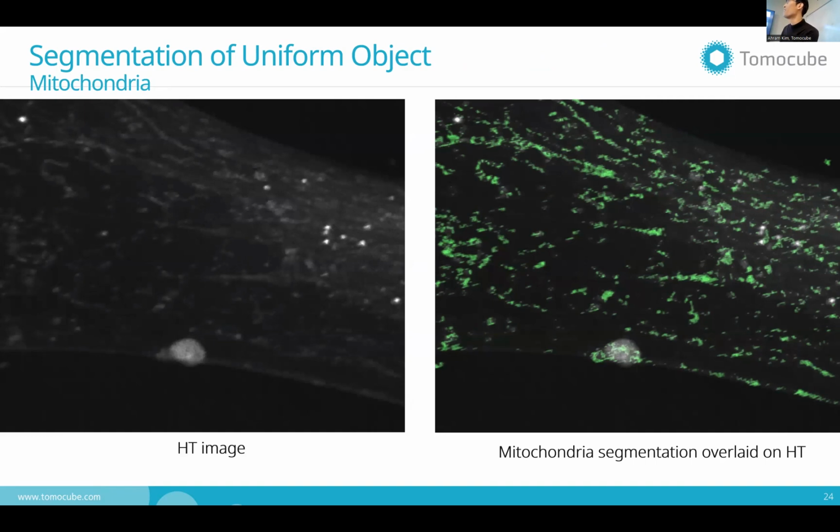I did not show the pipelines or the screenshots where I show the examples. Here you can see some defects like this. Here it's on the membrane, and it's mistakenly segmented as mitochondria. So we should exclude those as well, but not at the moment. I show this one as an example for those strategies for mitochondrial segmentation.